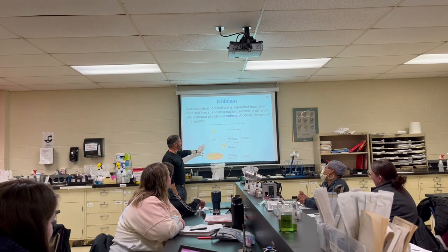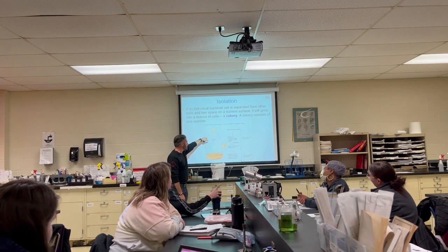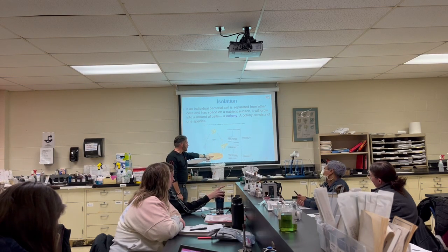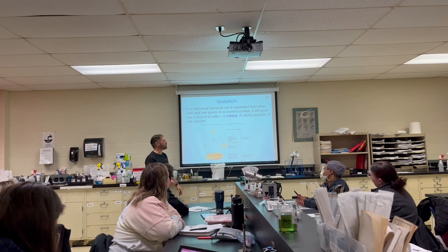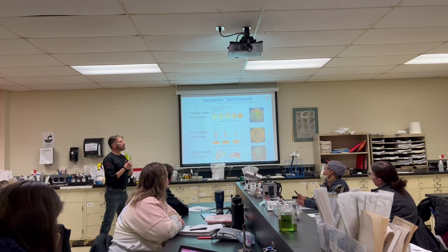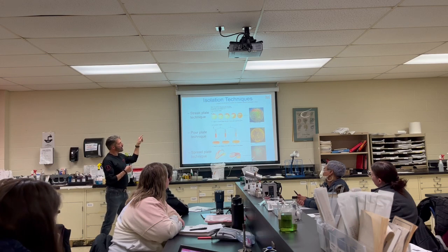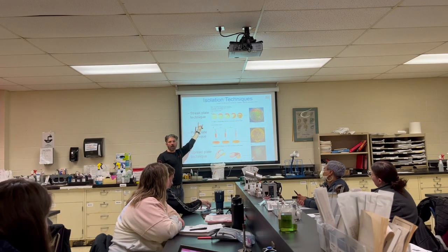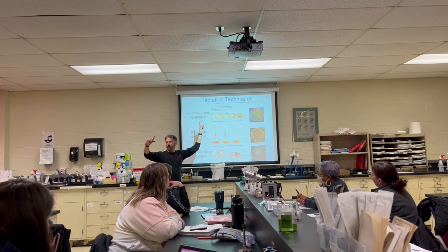Where am I? All right, so here, just showing you the parent cell. These are other cells. As we streak them out, we're going to separate them, and then these singular bacteria should grow into these colonies. I'll draw it up on the board later. This here is a streak plate. We're basically streaking something, and we're doing what's called a serial dilution. I'm going to move the camera onto the board and go over it real quick so you have an idea of what we're doing.